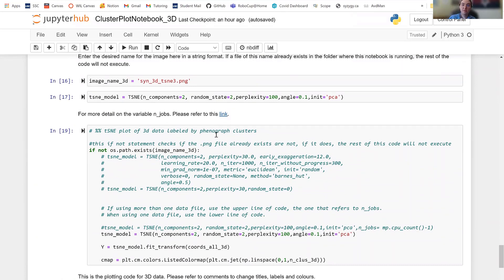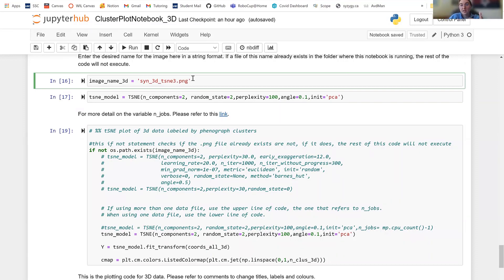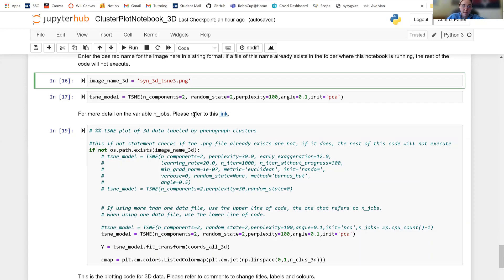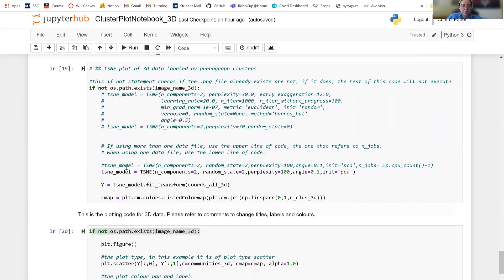And that's the image that you've set up here. So if you want to redo the image, you're either going to have to delete it or add like, underscore two, something like that, to then make it a different image that's going to output.